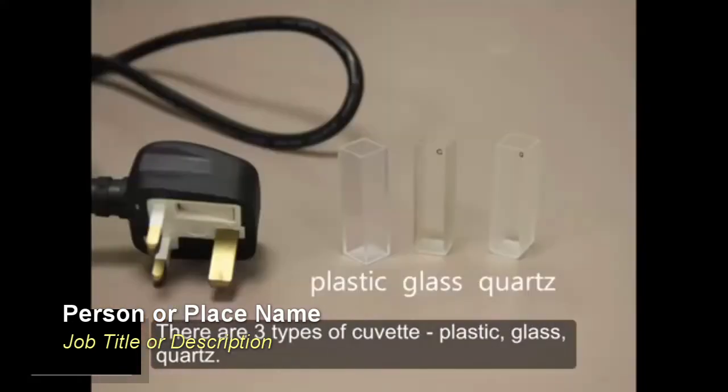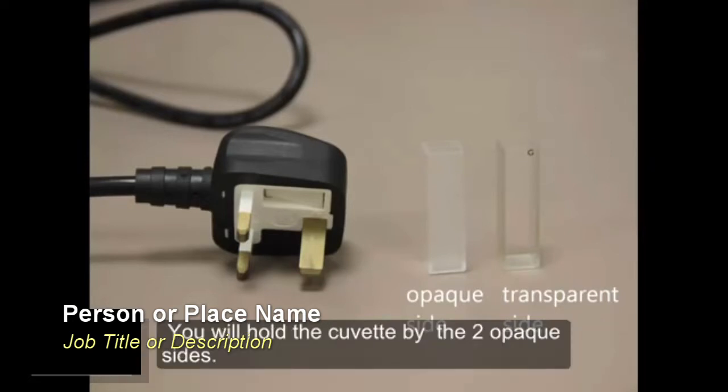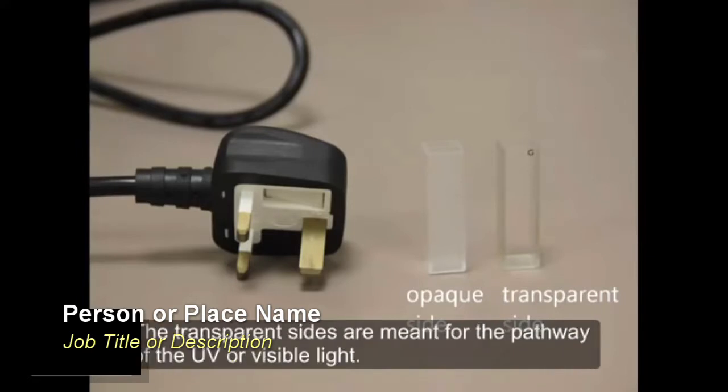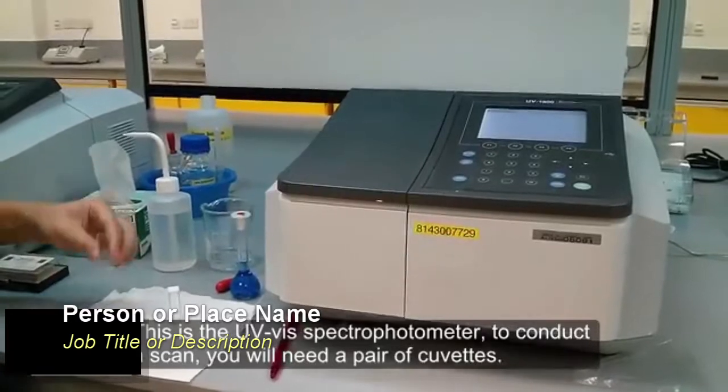There are 3 types of cuvette: one made of plastic, glass, and quartz. A common feature of all cuvettes is that each one has 2 opposite opaque sides and 2 opposite transparent sides. You will hold the cuvette by the 2 opaque sides. The transparent sides are meant for the pathway of the UV or visible light. This is the UV visible spectrophotometer.